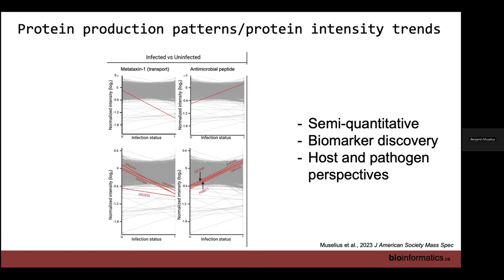So I think it kind of depends on what you're looking at and your familiarity with the samples, as well as the tools available. Before the break, Ben had talked about UniProt and how you could put your protein ID in there. If you find information that's involved in immune signaling or in a particular cascade, that can give you information to then know what it is doing and some functional information. Tomorrow we'll look at STRING networks to look at interactions between proteins. That could be another way as well. Depending on if it's immune signaling, we may be interested in cytokines, so that would be a place where we would start. And we could use that as a kind of positive control to map the pattern and see what else follows that same pattern.